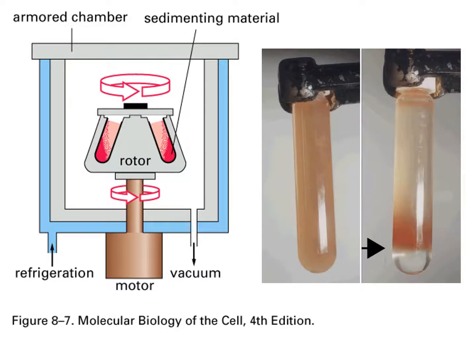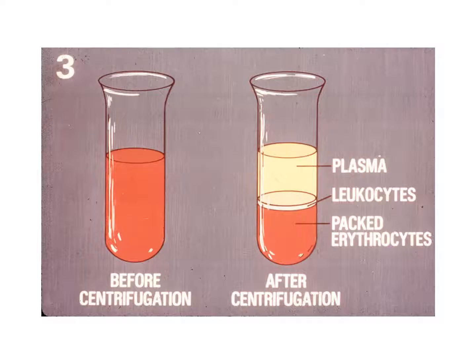Okay, so here's your centrifugation. Here's blood, and then here's your red blood cells. And notice, this is what I was discussing. You have such a dense material here. This very dense cannot go into this. It's dense, but not as dense as that. So it kind of catches everything here, the dense. Okay, so viruses would be in this area, that buffer zone there.